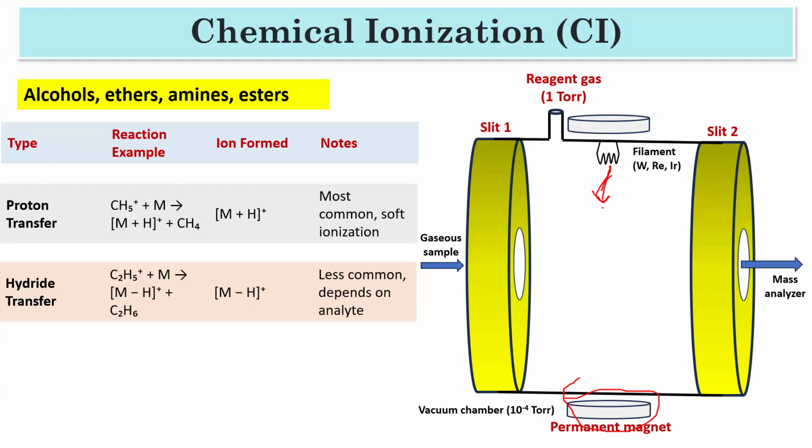The electron is already charged, and you put some magnet, so what will happen? Because of the Lorentz force in the magnetic field, these electron beams will move more easily, and we can control their direction. Okay, so please understand the purpose of these magnets. Sometimes you will observe that.